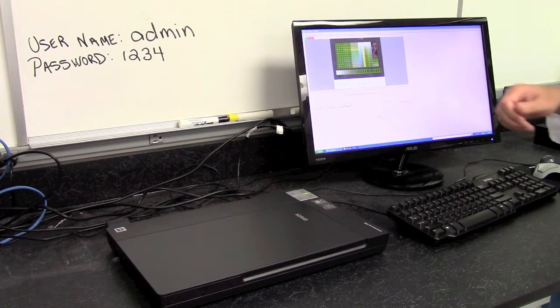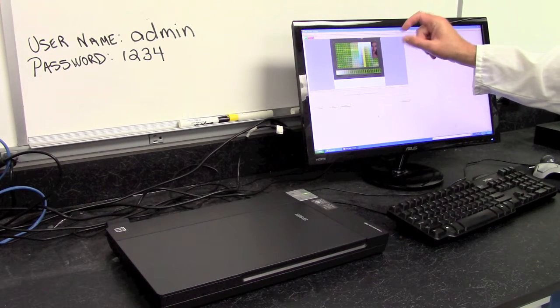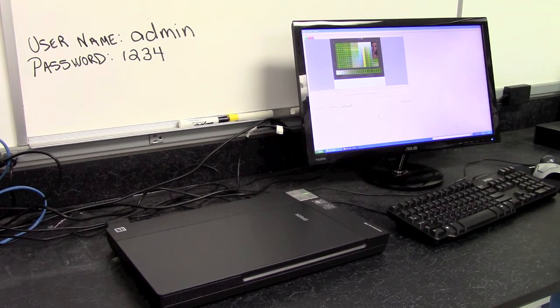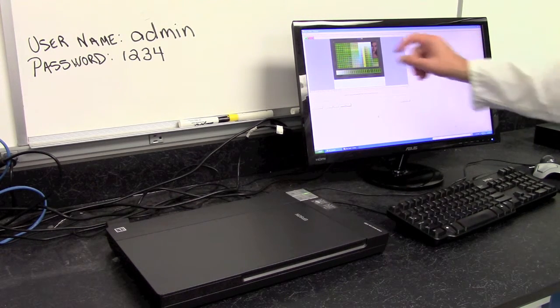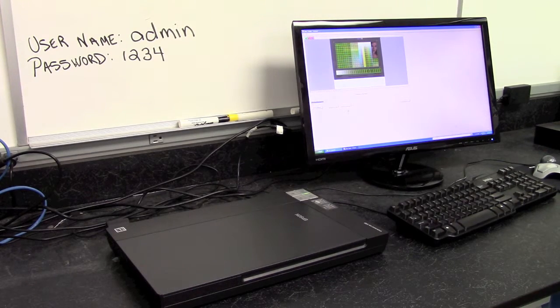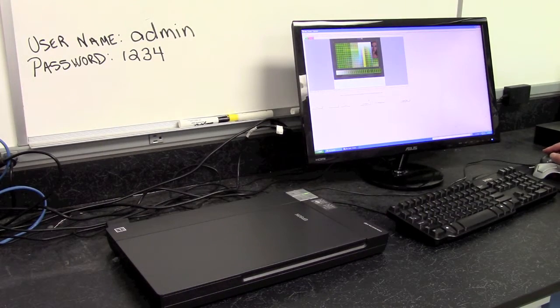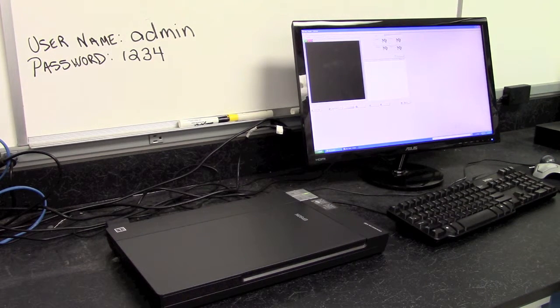So once it's scanned the color calibration key, you're going to see the image on the screen has all these yellow boxes that are superimposed directly over each color. And if it didn't align correctly, the yellow boxes will be off center compared to the different color squares. So you'll select the next button prompt, and it will save the calibration for that particular scanner, and then you should get a successful message. Once you hit OK, you can hit the button that says Home Page to go back to the beginning of the software.